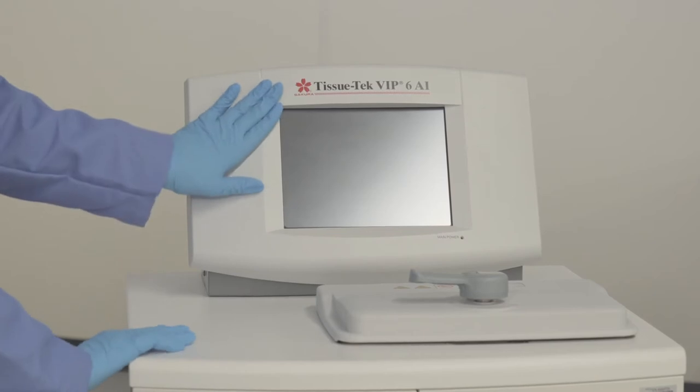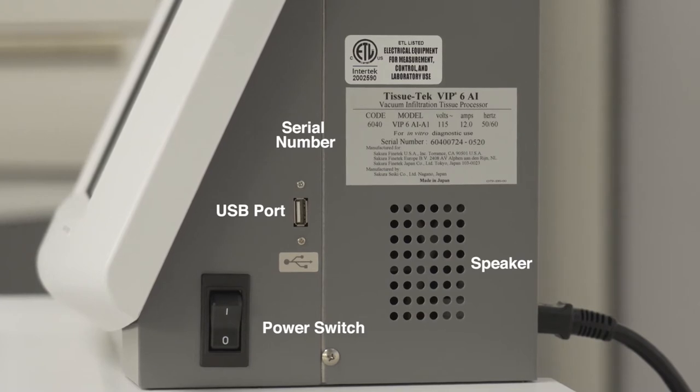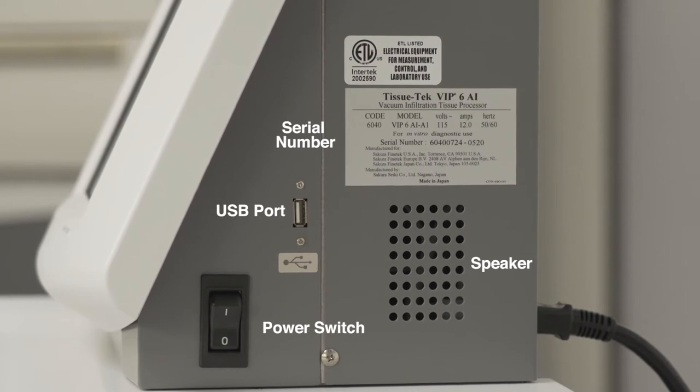The front of the unit is the LCD color touchscreen. On the right side of the control module you will find the power switch, a USB port to download data as needed, a speaker, and information on safety rating along with the serial number of your processor.